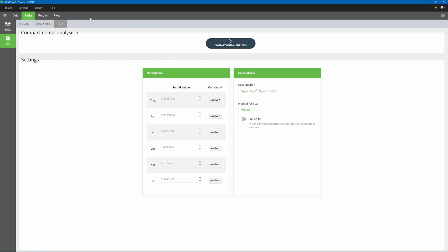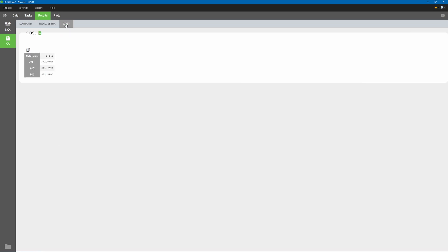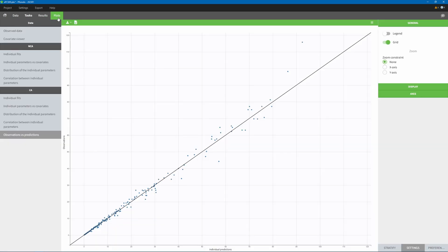It is now possible to see the individual cost reported in the individual parameters table, as well as global cost in the brand new Costs tab. AIC and BIC estimators are also reported. Additionally, you can diagnose model misspecifications in a more efficient way using the new Observations vs. Predictions plot available after running CA.